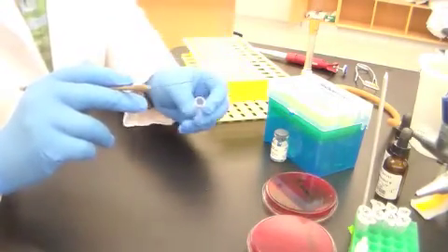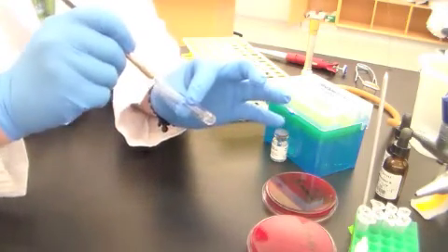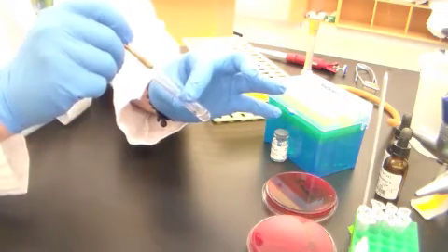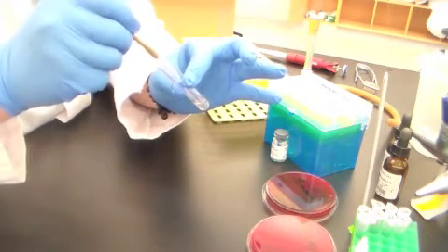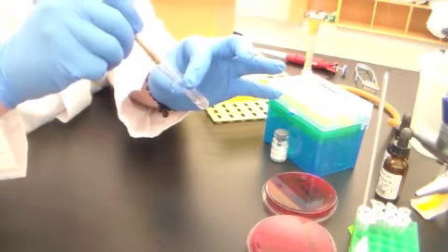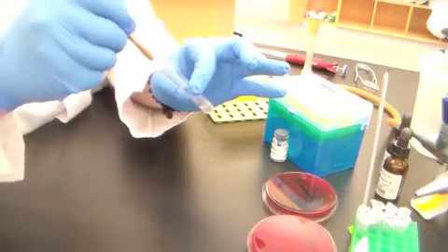And now I'm going to go into this rabbit plasma, and I'm just going to work that Staphylococcus pellet until it is largely in solution in the serum. You can hopefully see a little bit of turbidity in the serum as this is going.